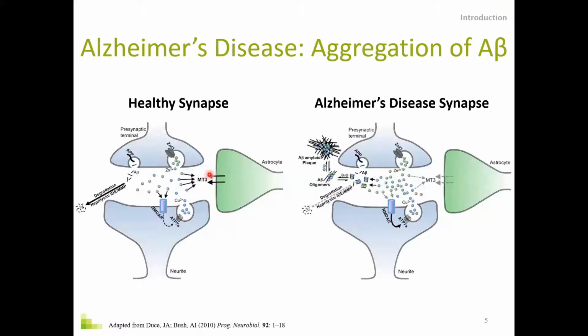And then how long did one spectrum of HERFD take? It kind of depended on which ones we're talking about. In the beta amyloid one, where we were looking at the photoreduction, I believe those scans were about 30 minutes. We can go faster in terms of scanning in other samples where the rate of photoreduction is affected by a number of different components, and so we can scan faster. But it becomes a question of getting the best signal to noise while minimizing photoreduction.